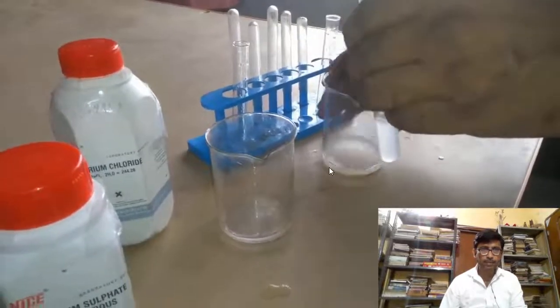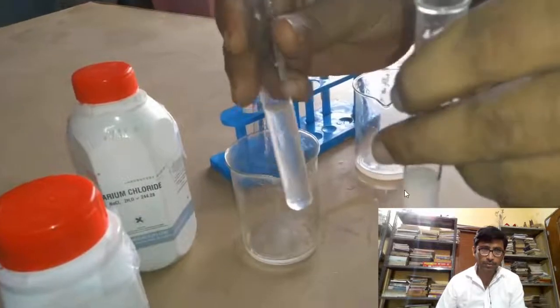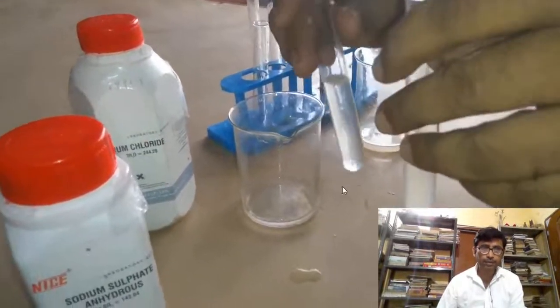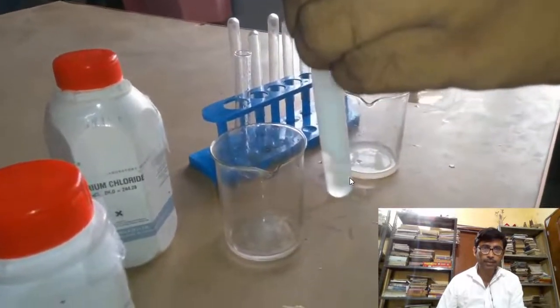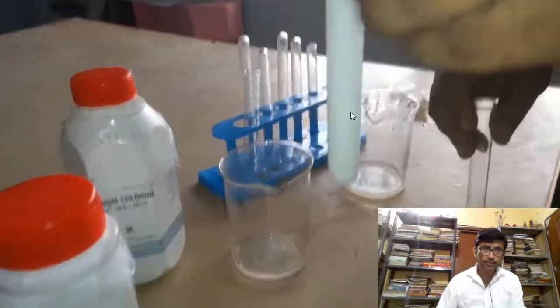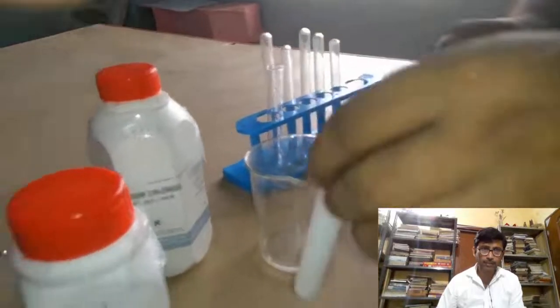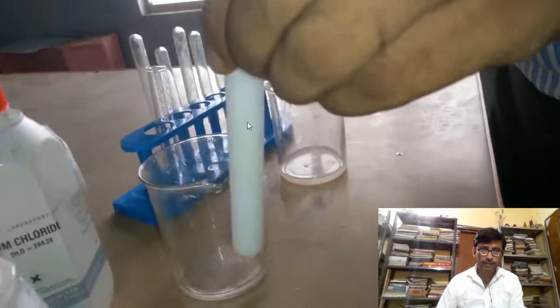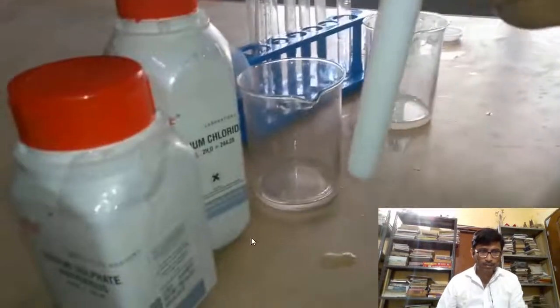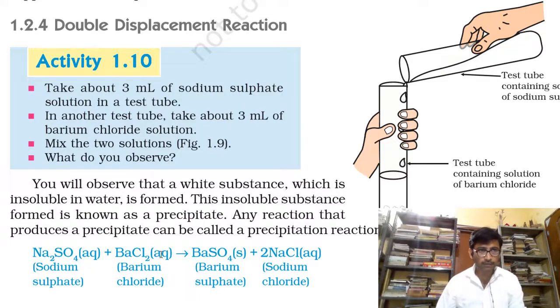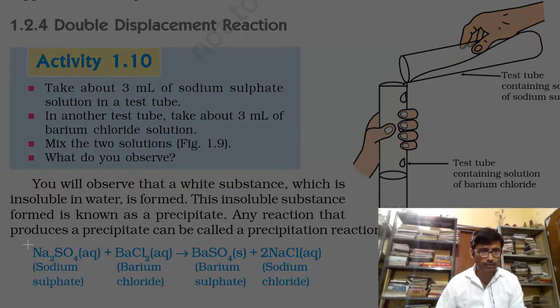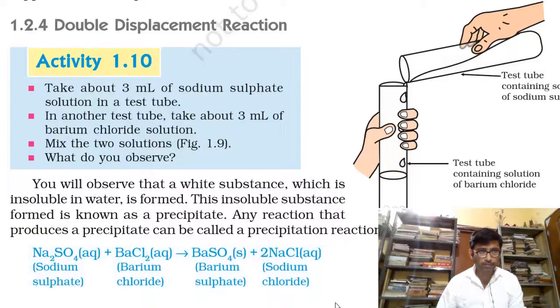Now both solutions are in two test tubes, and what we are going to do is mix the two solutions so that they can react. Barium chloride and sodium sulphate are now in the two test tubes. When you mix them together, you immediately see that you get a white precipitate — this is barium sulphate. We will soon come to a discussion of what a precipitate is.